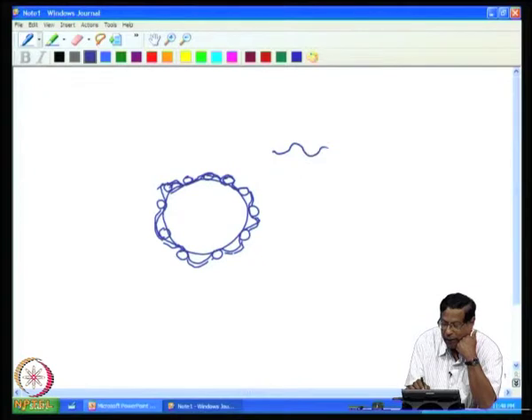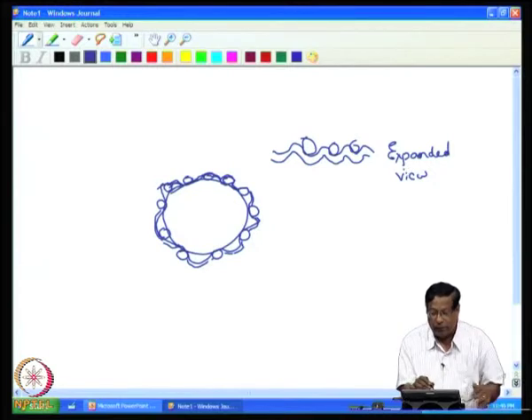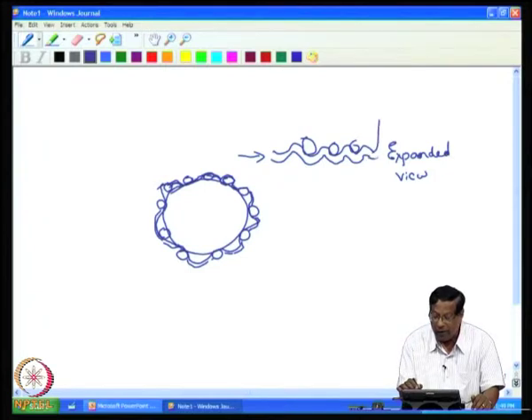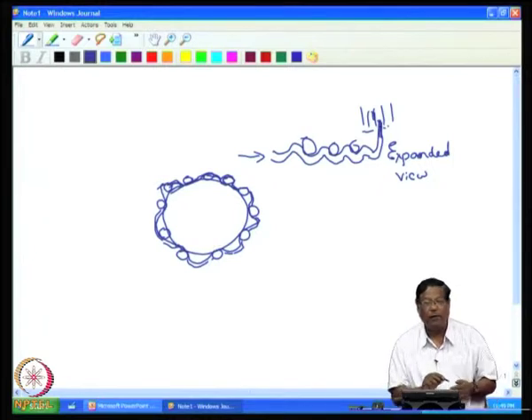The tube will have a system like this. This is where the ball bearings are situated. This is an expanded view. So, the sample will move like this, and without touching any of the parts, it will be coming, and the tube finally enters the concentric tube in the plasma, that we had shown here earlier. So, this is a peristaltic pump.